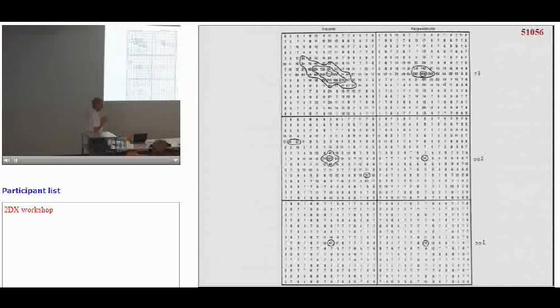Of course, it depends on your transform and how flat your crystal is and so on. And this is after unbending, and you can see that. Again, we're using only the spots out to 7 angstroms to create the reference image to do the unbending. So there's nothing in the whole procedure that looks at anything beyond about 6.5 or 7 angstroms. So these spots here are a proof that you've done it all quite nicely and correctly.